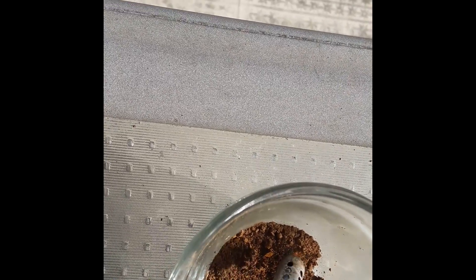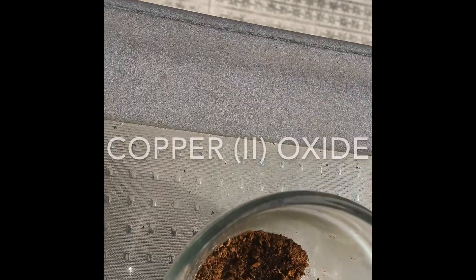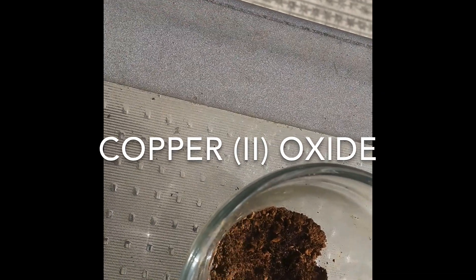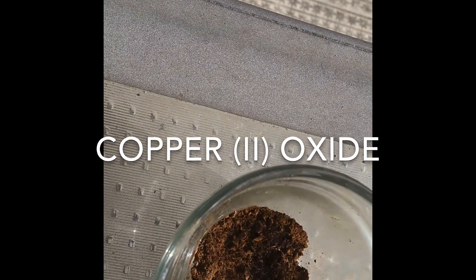You'll notice the color change — copper oxide with two oxygen atoms bonded to it is black, rather than an orange rusty color.